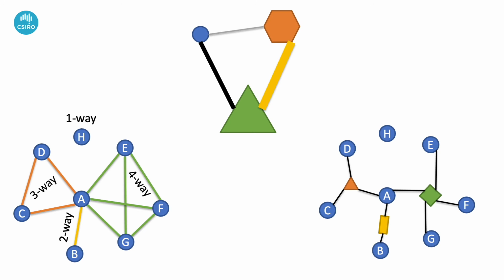So the first mode is perfect when you want to study which regions of the genome interact with each other. We are not really concerned about the order of interaction. And the second mode is great when you focus on the interactions themselves.